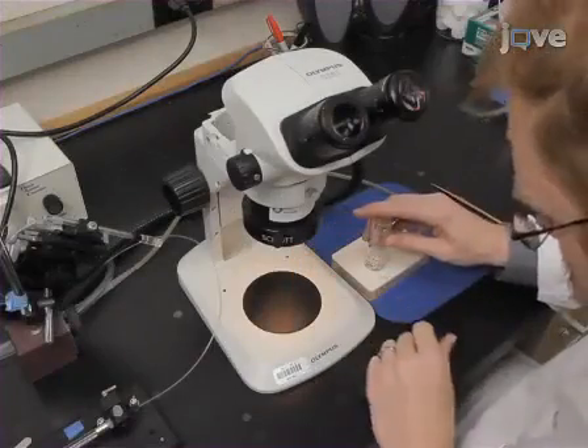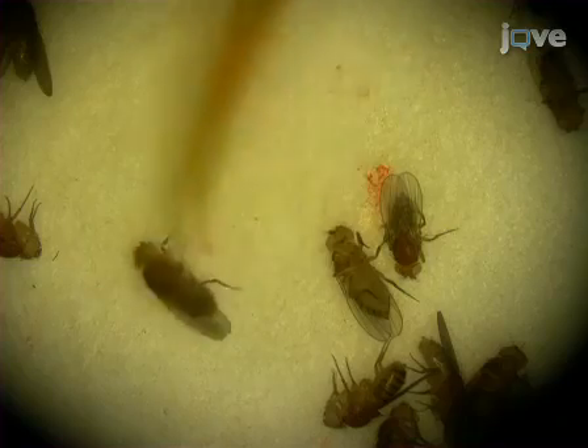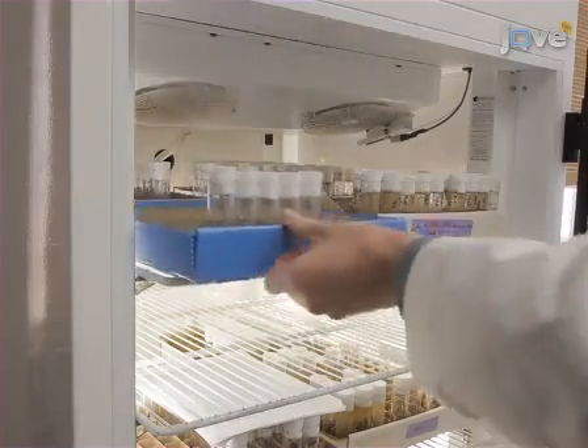Collect flies within 24 hours of eclosion by anesthetizing them using humidified carbon dioxide. Sort out female flies and place them into vials containing standard diet. Allow the flies to age for 10 days.